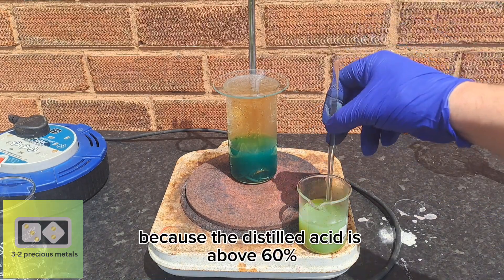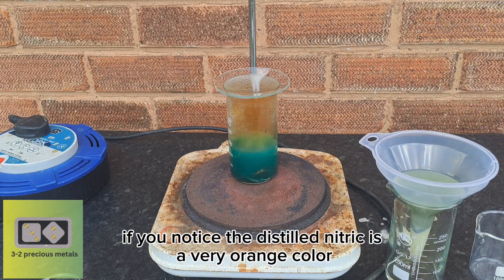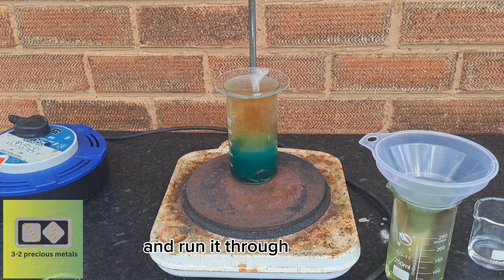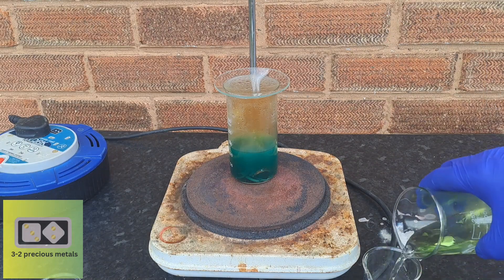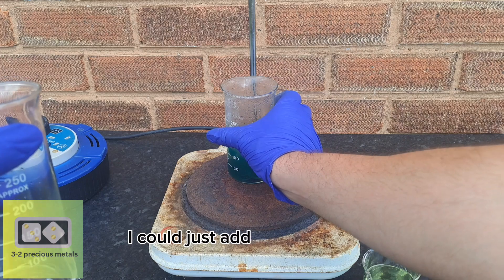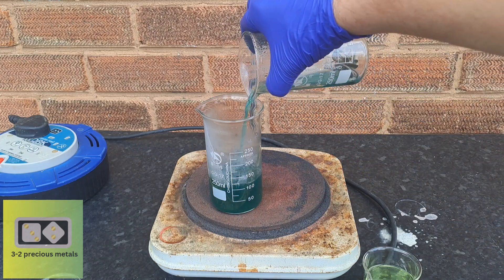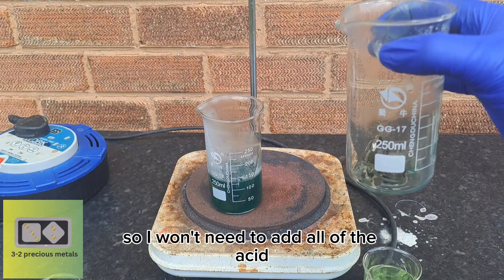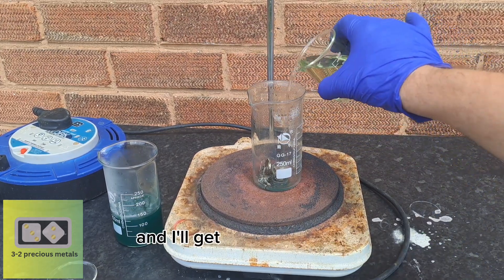Because the distilled acid is above 60%, I'm doubling the volume by adding some distilled water. The distilled nitric is a very orange color — this is nothing to worry about, it's just a little excess nitrogen dioxide gas, which will clear up once I run it through the filter. I'm going to decant the solution into the empty beaker and add some fresh, now dilute acid. There's not much left to dissolve — over 50% has already dissolved — so I won't need all of the acid; another 50 milliliters should do the trick.